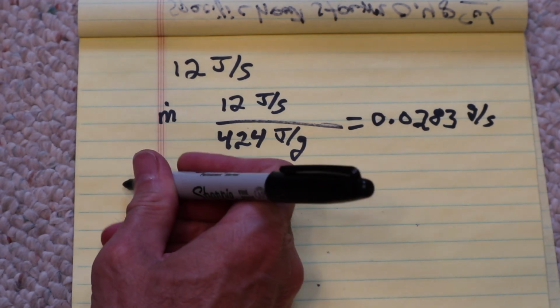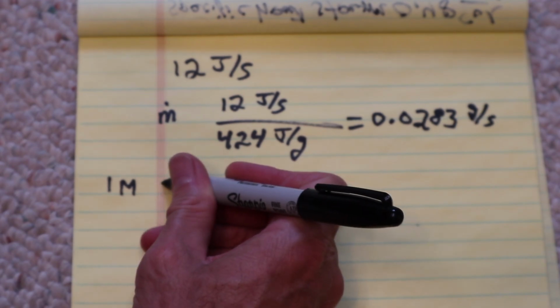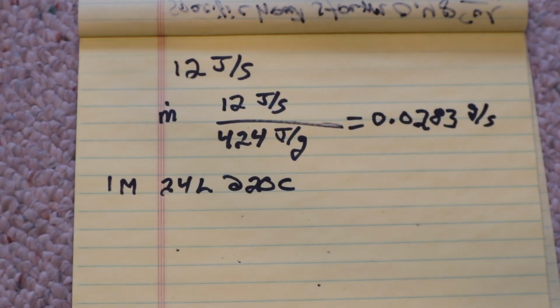Well, we know that 1 mole of gas occupies 24 liters at 20 centigrade. The 22.4 liters you might be thinking of for a mole of gas is at 1 atmosphere and I believe 0 degrees centigrade. We're talking about room temperature, so it's a little bit more. So how many moles of gas does this represent? Nitrogen is diatomic, so it's 28 grams per mole.